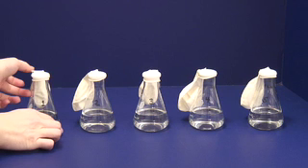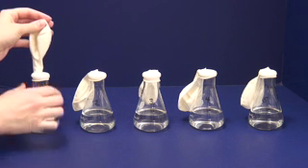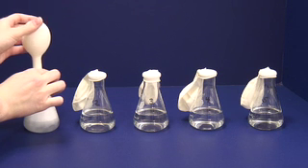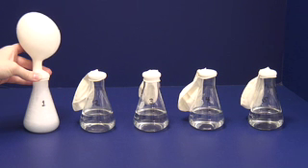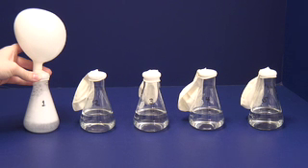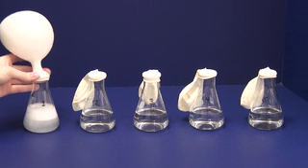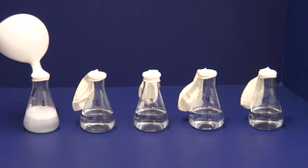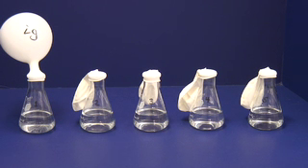This is the first flask, which contains 2 grams of baking soda. What do you predict will happen now with twice as much baking soda?